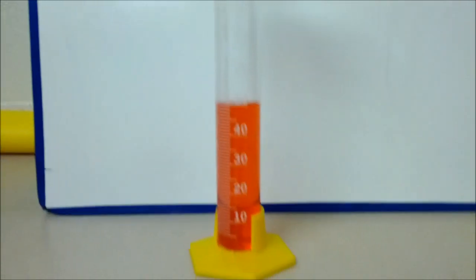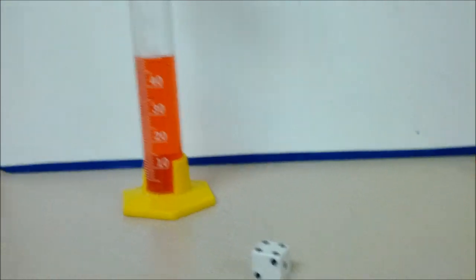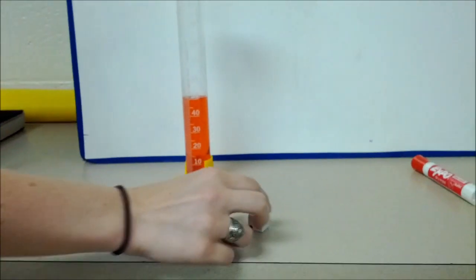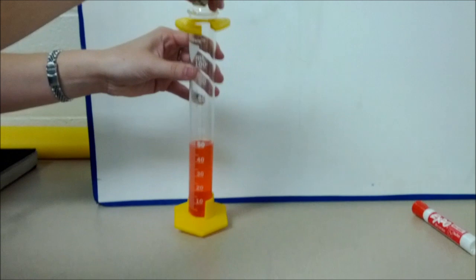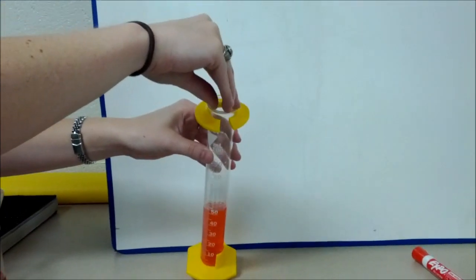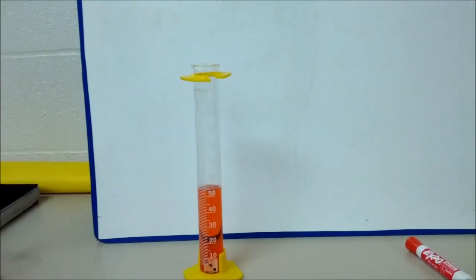All right, so we started out with 50 milliliters in here. Okay, now we're going to take our number cube and drop it in. Tilt it and slide it so we don't just drop it and make a big splash.